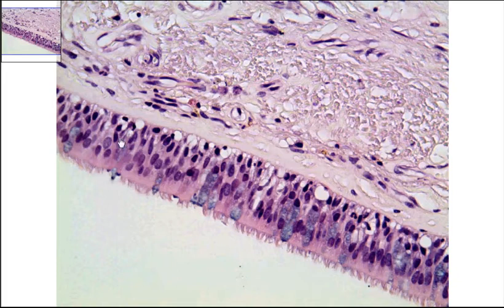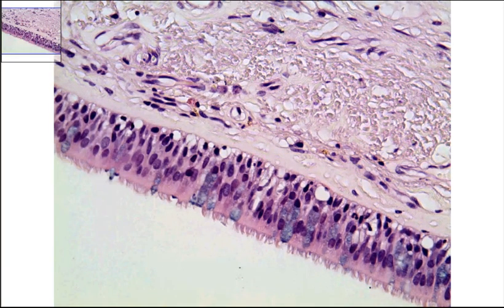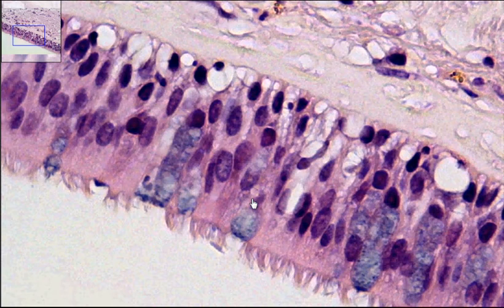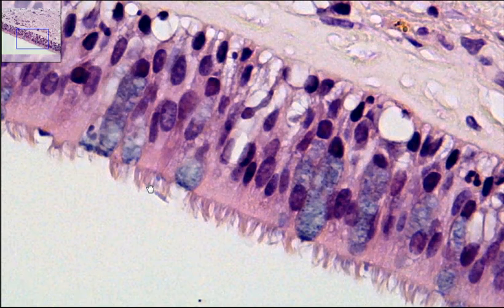Hopefully you can recognize that this layer right here is going to be your ciliated pseudostratified columnar epithelium with goblets. If we zoom in, we can see the individual cilia right here. The cilia are going to be on the apical surface — the surface that's exposed to the inside of the trachea.